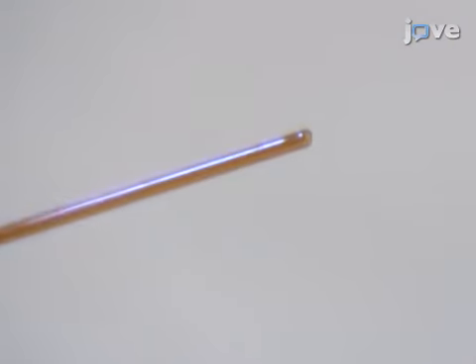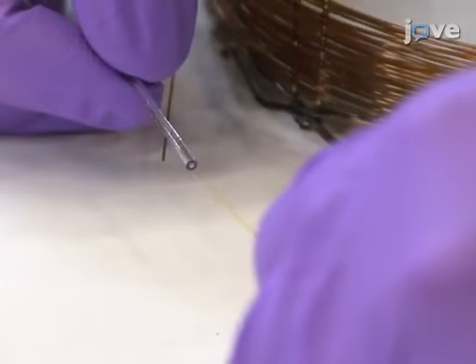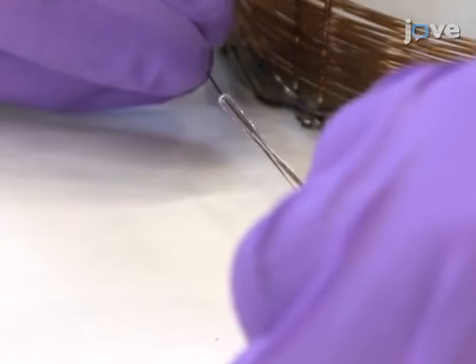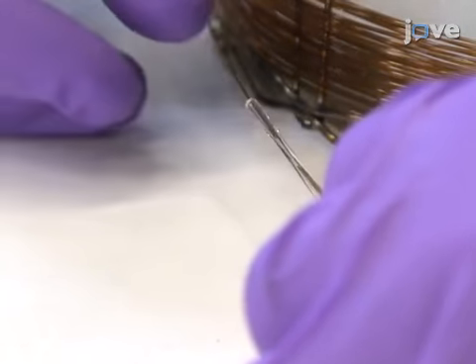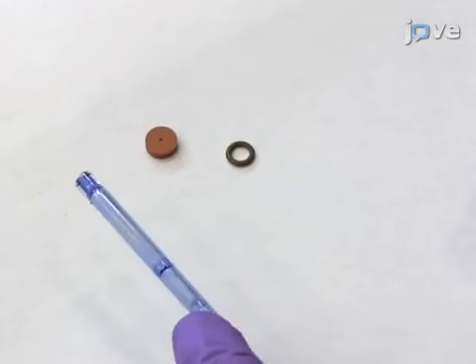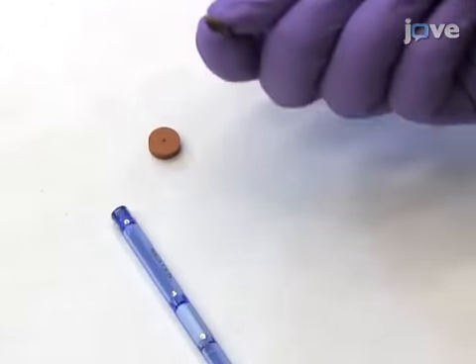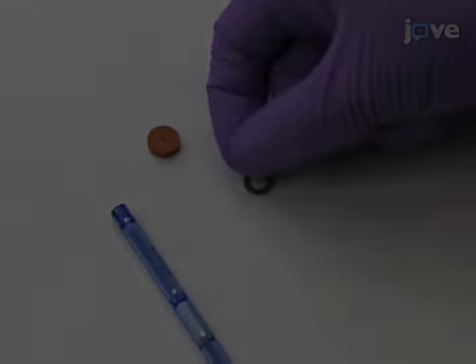Ensure that both edges of both primary and secondary columns are cut straight without sharp edges. Then, connect the primary and secondary columns using a press-tight connector before the modulator. Ensure that the glass liner, non-stick liner O-ring, and septa for the GC injector are new and free of contamination.